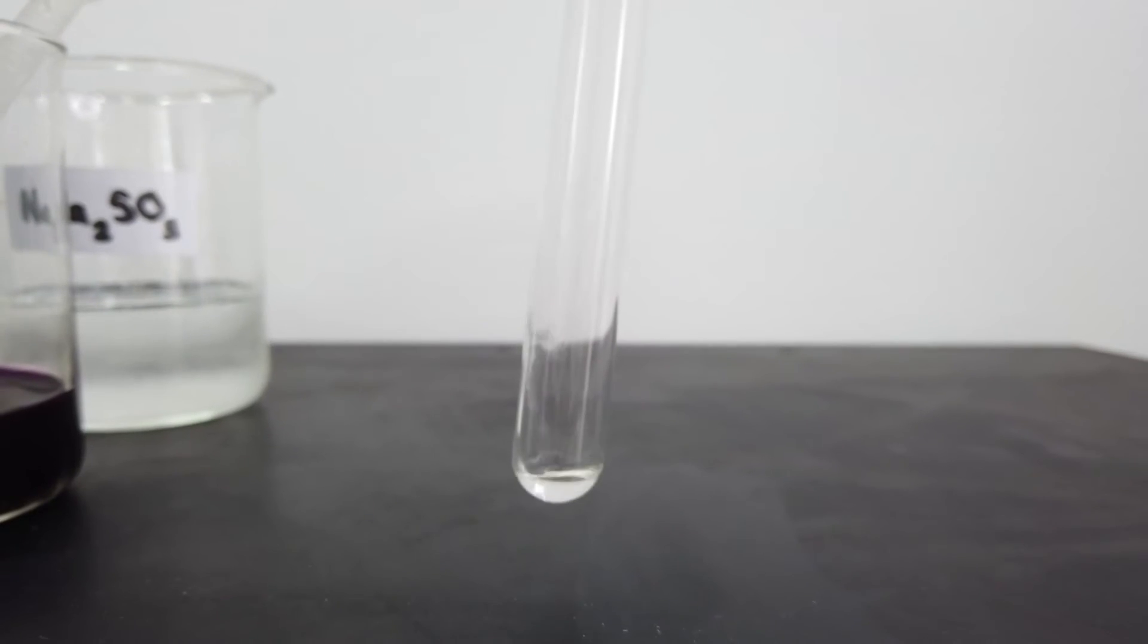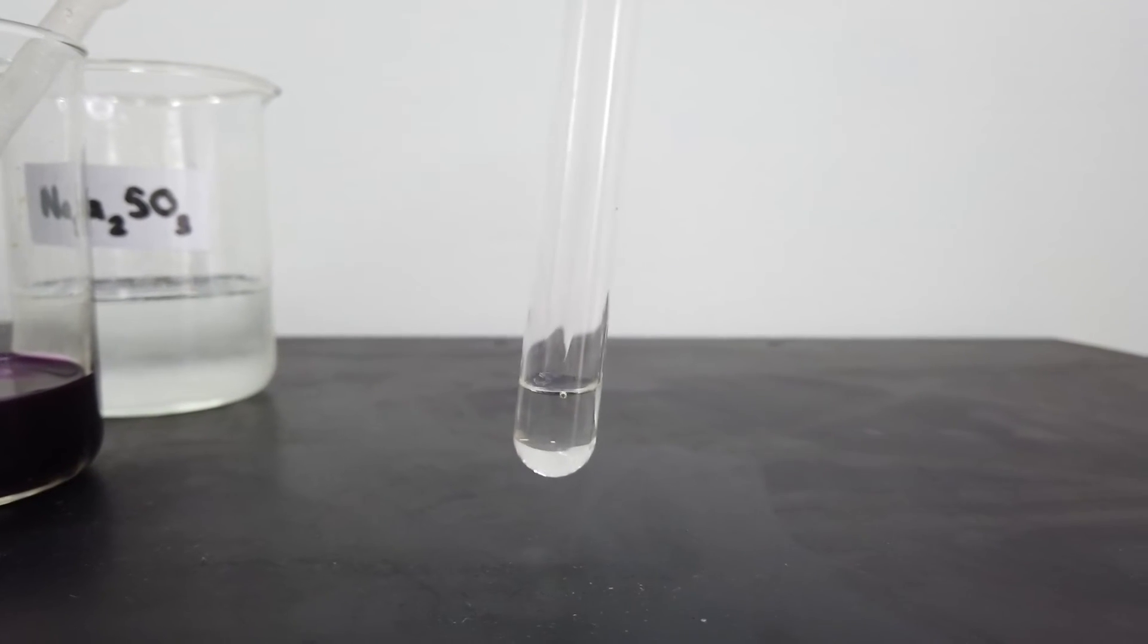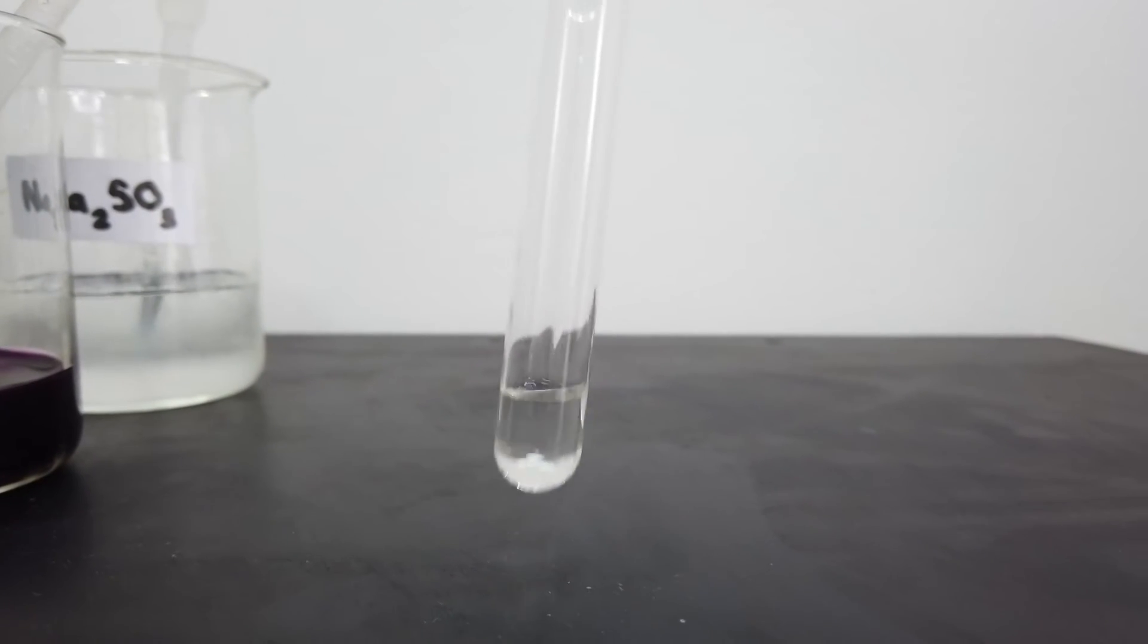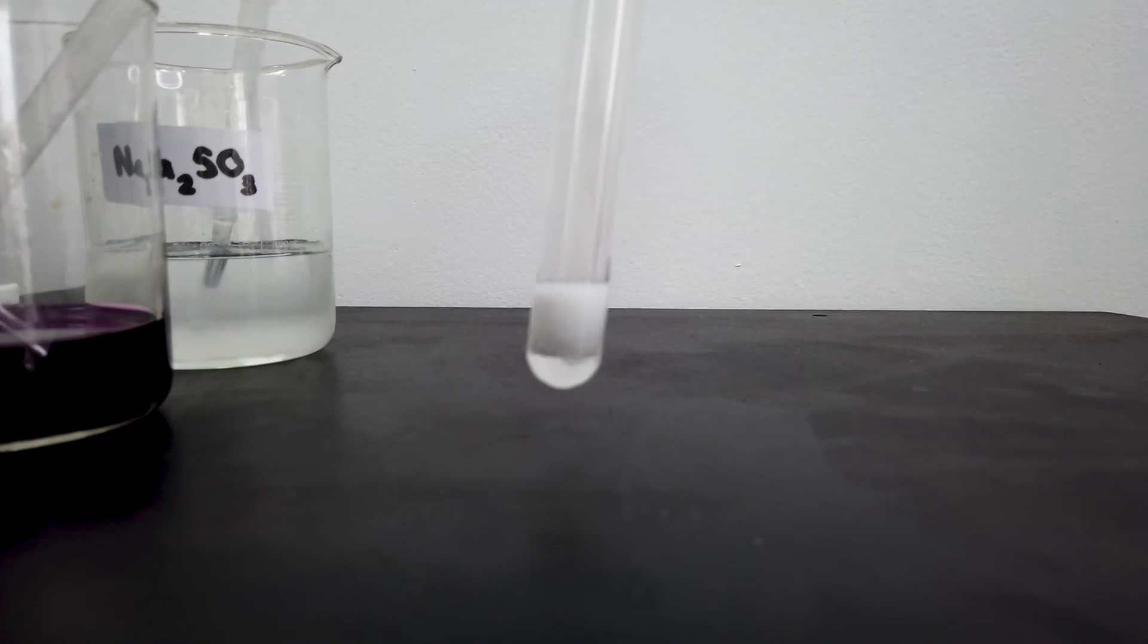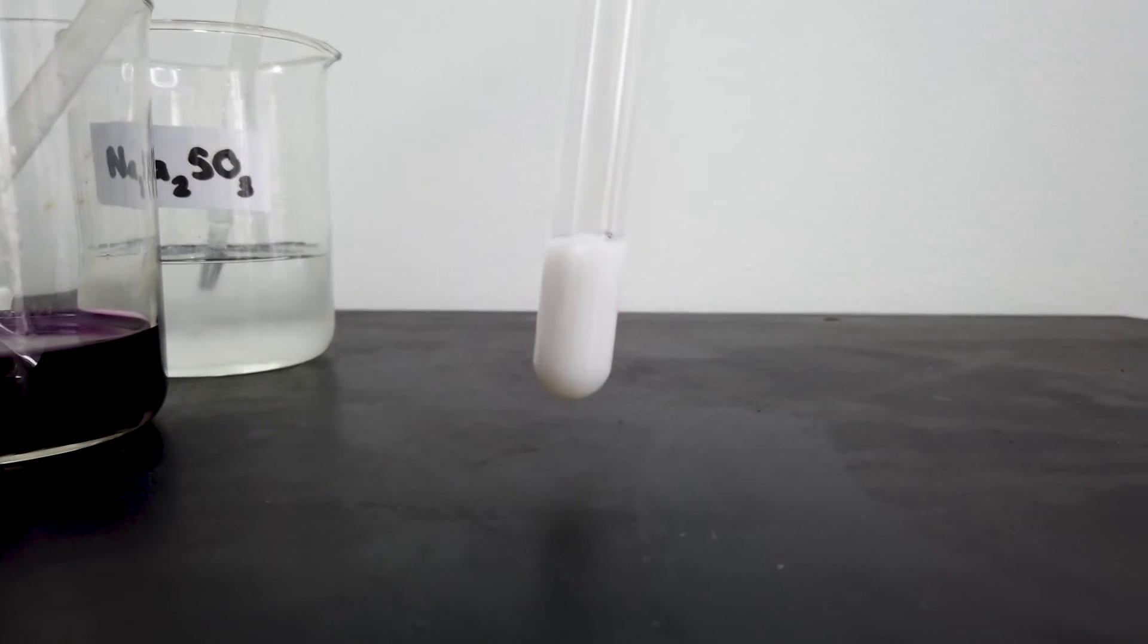Again add 1 cm depth of sulfite ion solution into a test tube. To this add barium ion solution. A white precipitate will form.